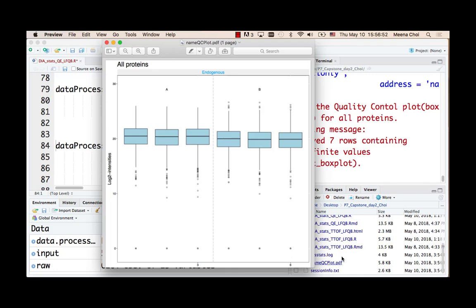But for normalization, at this moment, we don't have any suitable assumption for these 11 proteins, so we are not gonna do this one here. But actually, you can see they're actually very slightly different between this line here and then this line here and so on.